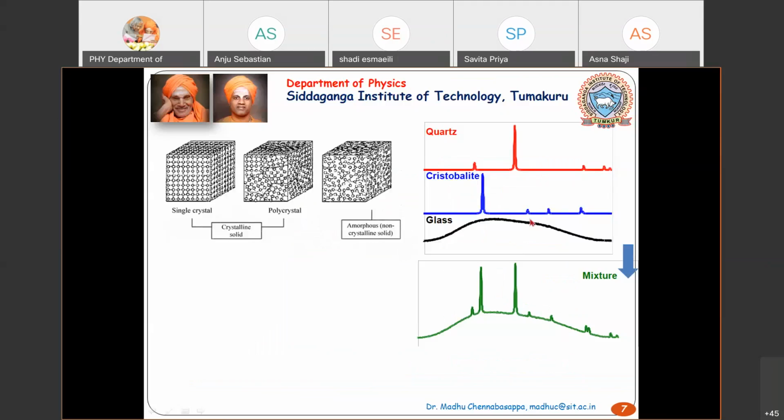Okay. So there are some things that you need to take care of. If you want to say it has a good match, meaning a very good phase identification, then you need to take care of these things. One is, you can see here, this is at very high angle, so the position and intensity are matching. This one has around 400 intensity, this may have something like 250 intensity, but this is also matching the trend in your sample.